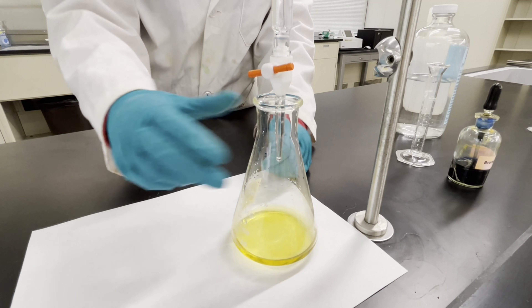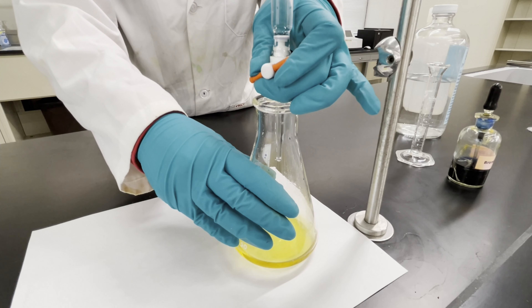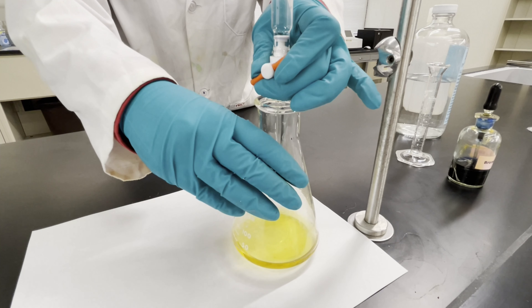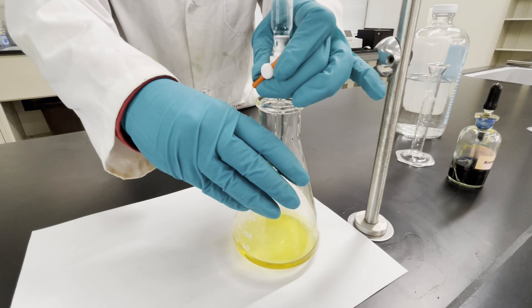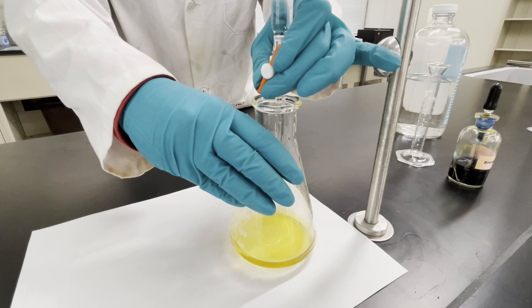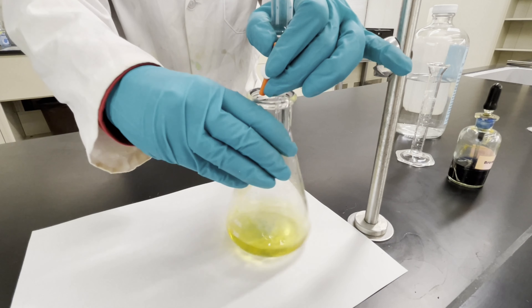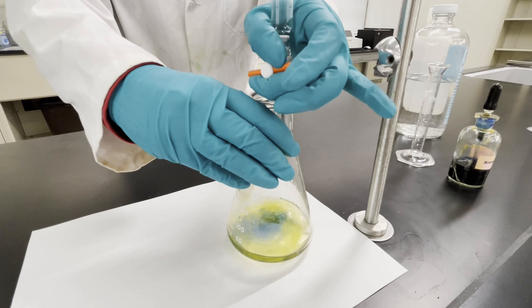For example, in this titration, we measured 10 milliliters of a known amount of hydrochloric acid. We know the amount of acid added, as well as how this reacts with the base. In this case, hydrochloric acid will react with an equal amount of sodium hydroxide base. When we add the base, we keep track of the volume added by checking the initial and final volume on the burette.